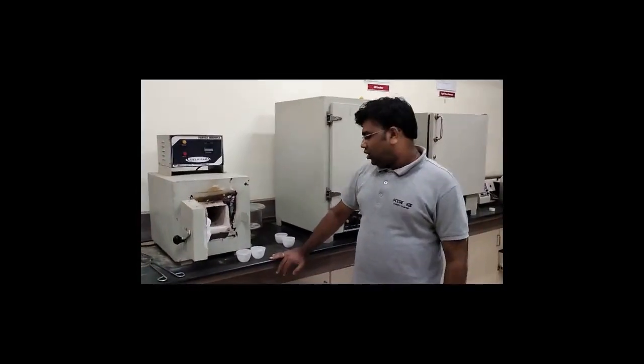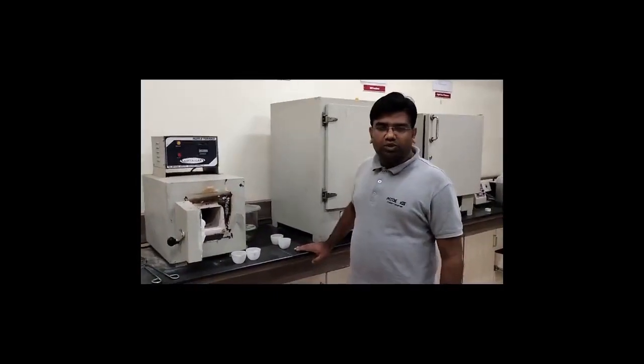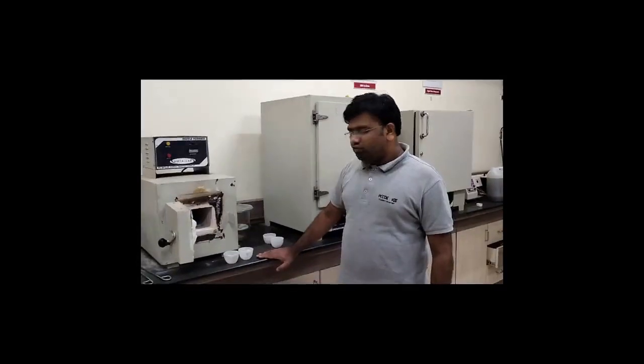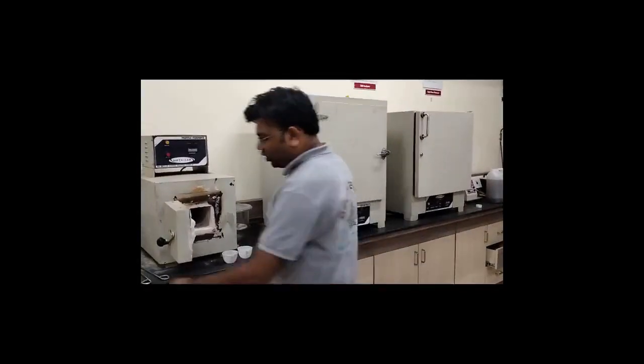So now we'll be taking the weights of the A and B crucibles after they are cooled. Meanwhile, we are going to keep the TDS crucibles for the further process in the muffle furnace. The same thing we are going to do.